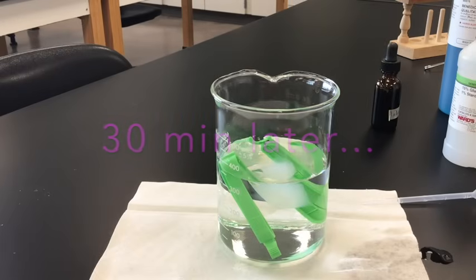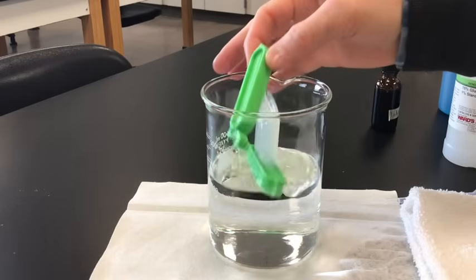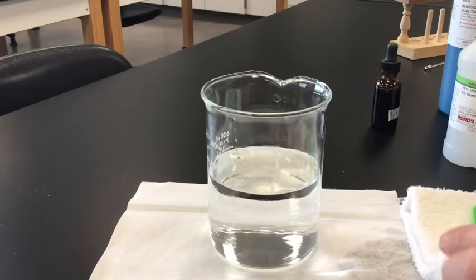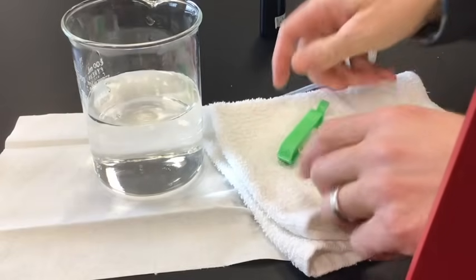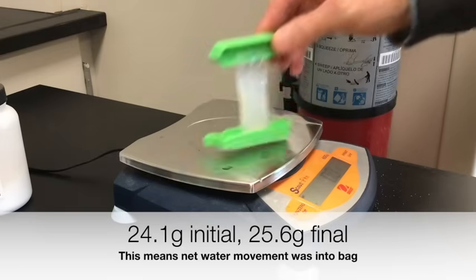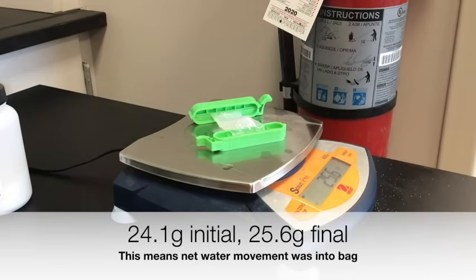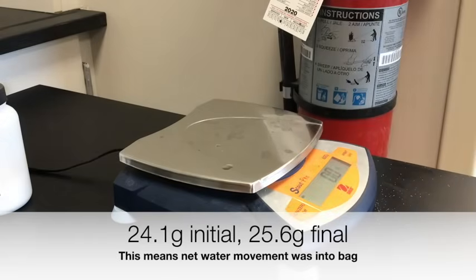It's been about half an hour, so we've given this time to diffuse. The first thing we're going to test is whether water has moved into or out of the dialysis bag. We're going to weigh the bag again — take it out and dab it dry. If it weighs more, water has diffused into the bag; if it weighs less, water has diffused out. We're now at 25.6 grams, so that number has gone up, meaning the net amount of water has moved into the bag — more water moved in than moved out.